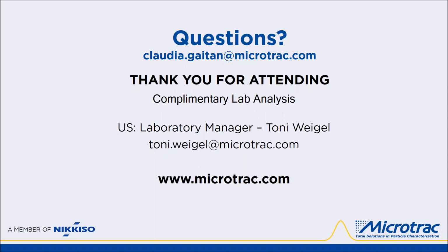What is the smallest volume of liquid that can be used? That was 0.1 cc, or I'm sorry, that was for the dry. The smallest volume of liquid, I would have to refer you to someone who has that information handy. I don't, but Claudia's email address is here on this slide, and you can send any questions that you have right now or you might come up with later to her, and we will get back to you.